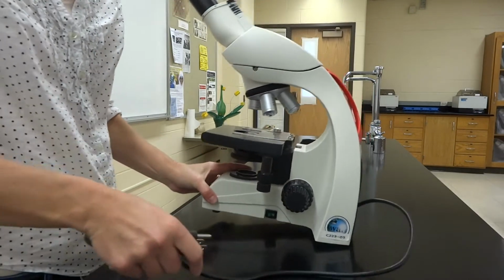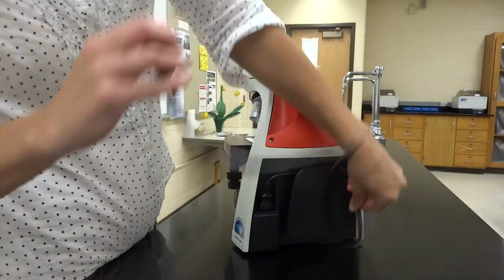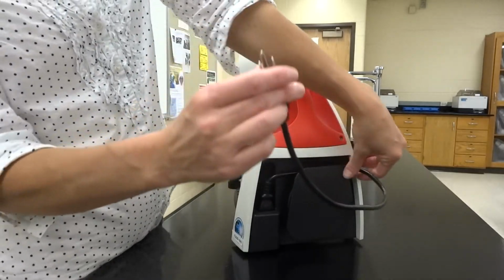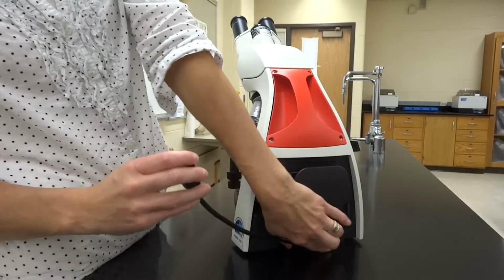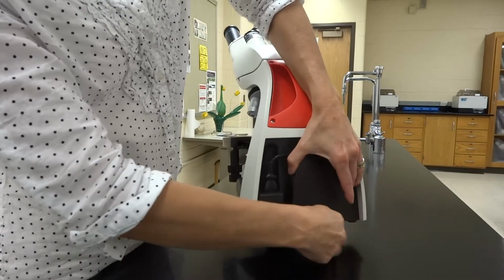wrap that cord, holding the plug, right back up. Very important, so this doesn't whack you in the eye. And then get it fitted nice and happy in there.